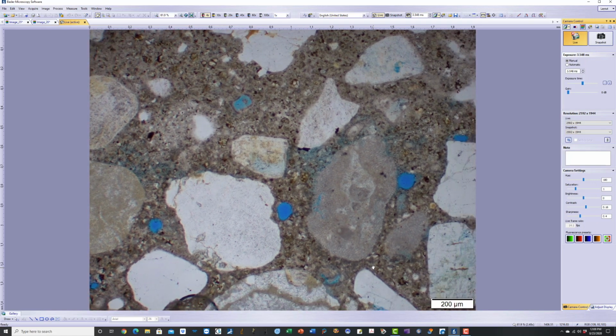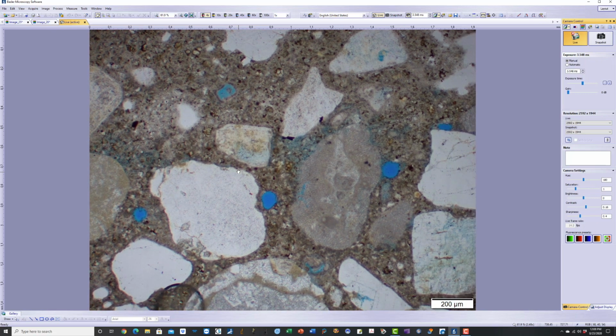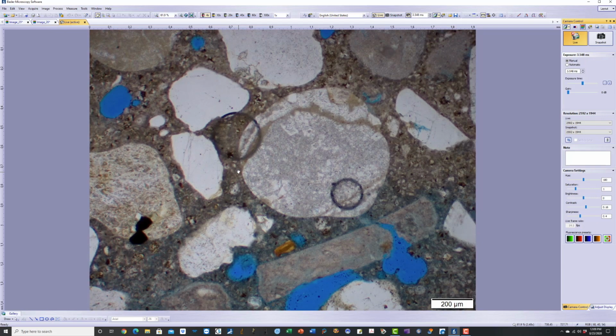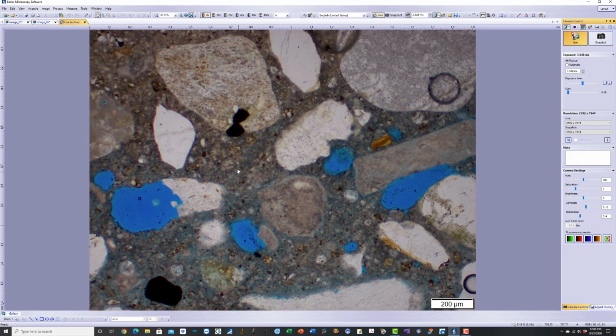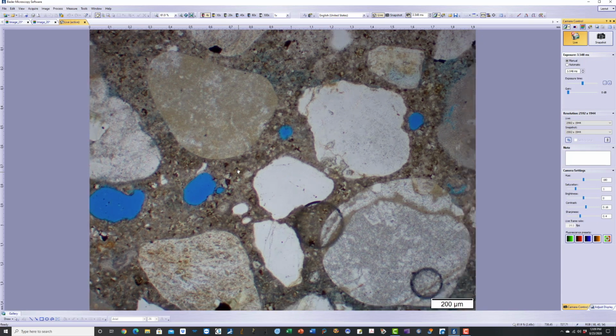Here you can see a belite cluster in the middle with interstitial ferrite phase of the residual cement. There are abundant residual cement particles scattered throughout the dense Portland cement paste. So this is the denser part of the mortar, protective mortar coating. Then you have a relatively porous part of the mortar coating. And this denser part, the reason the paste is densified is because it's been carbonated.